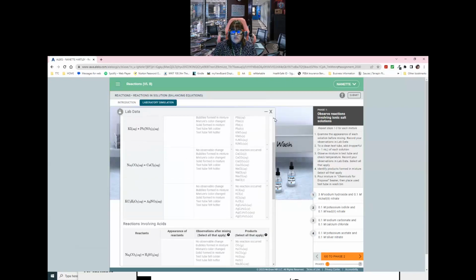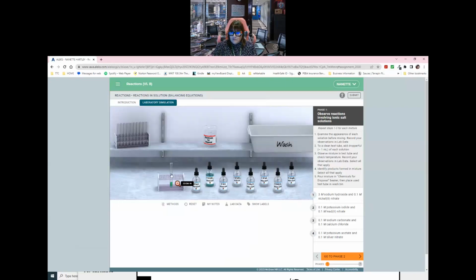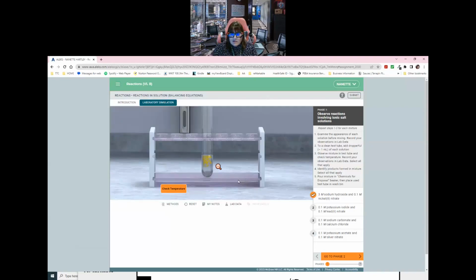So let's go out and take a look. Chemicals for disposal, put that in a wash, we get a clean beaker, and then this is our next one. It's clear, and this one's clear. We mix them together. Oh, I mixed the wrong things. Hold on.